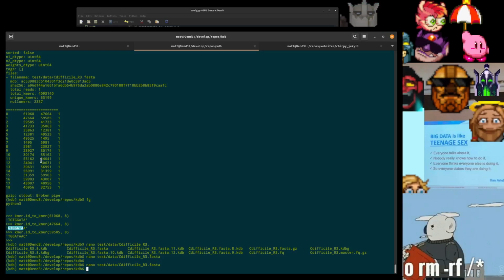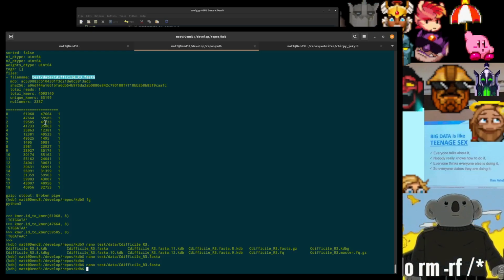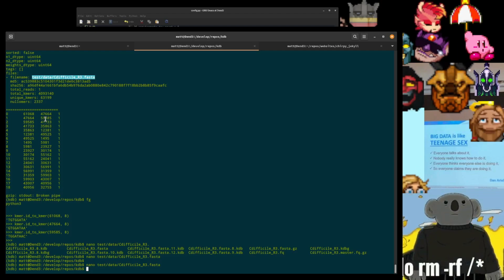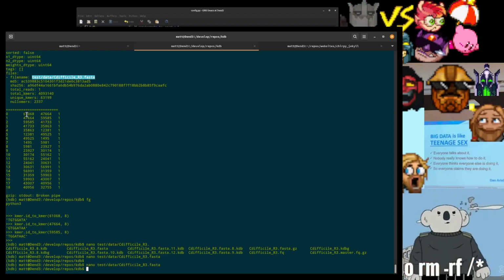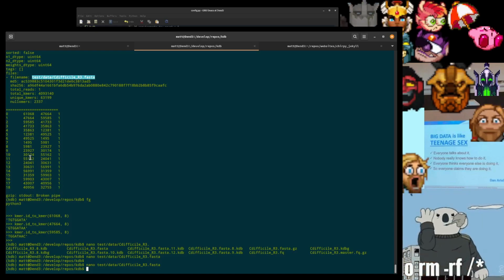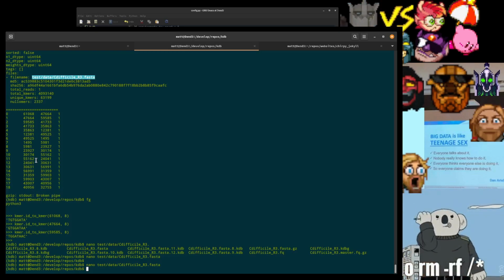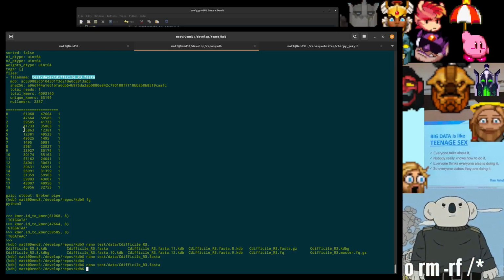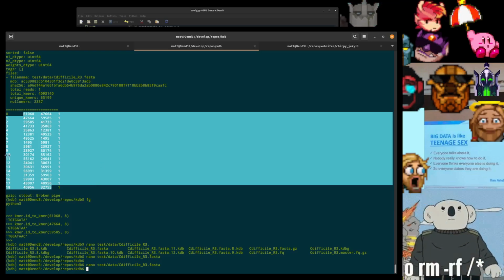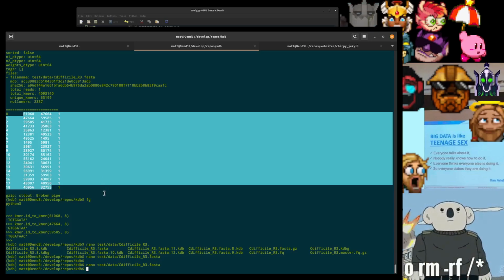So you can assume that if you were to add FASTQ files or other data into a single graph, then you would get an adjacency list from this format, and it would tell you at least what kmers it's found that are consistent with respect to one sequence, and then from that you could do graph traversal and collapse at some point in the future.